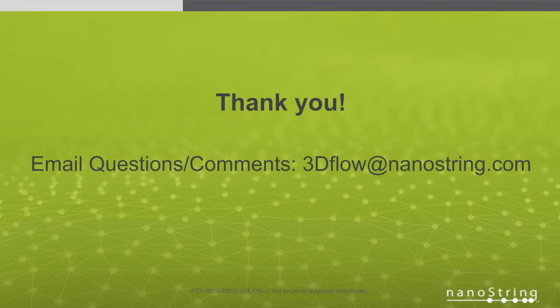So ideally, they would be tested prior to activation status, but it really depends on the numbers. If the target is to obtain 5,000 antigen-specific T cells, the numbers and frequencies you're starting with will obviously impact the strategic design of the experiment. I think that's one of the challenges, and also something we have the opportunity to measure in a robust way, to look at what those changes are under different types of in vitro culturing conditions and systems.